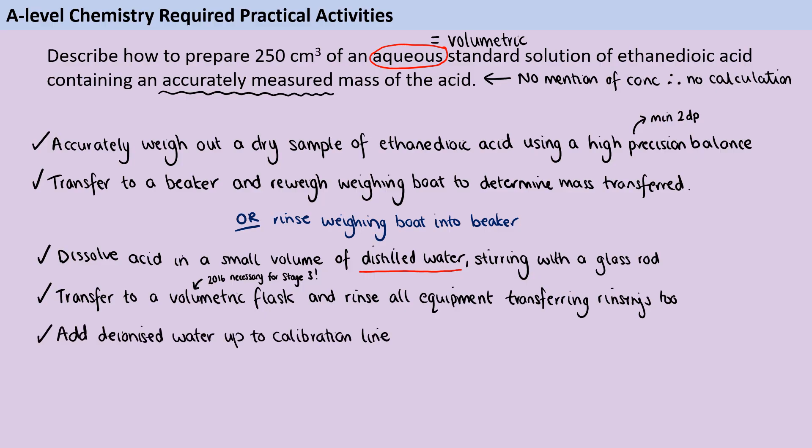Now we're going to add deionized water or distilled water up to the calibration line. So that line that represents where exactly 250 centimeters cubed or whatever the volume of that volumetric flask is. And when you're doing that, at the very end you want to be using a dropping pipette because you don't want to overshoot. Once you've added some extra liquid you can't take it back out again, you just have to start from the beginning. So we're definitely using a pipette at the end. And of course, whenever you're measuring the volume of anything, you want to hold it up to eye level and you want to be measuring from the meniscus. So make sure that you've got that at eye level so that you're accurately measuring there.